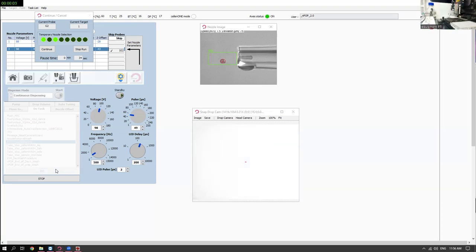Because we didn't like how it was dispensing. You can return a certain volume of it to the well plate if you wanted to. It's just DMSO, or that then puts it in the back. Then I'll grab myself a pin wipe.